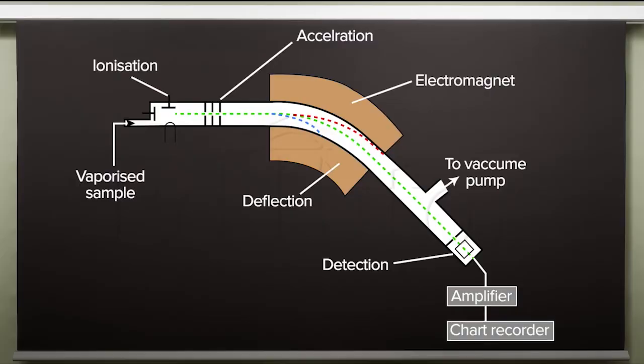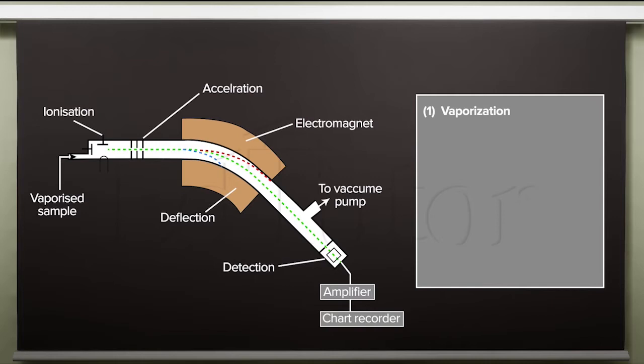Now that you have understood what mass spectrometry is, let's dive in a little deeper into this procedure, shall we? In this device, the substance that we want to analyze is first converted into its vapor state by keeping the pressure of these vapors extremely low, about 10^-6 to 10^-7 torr.